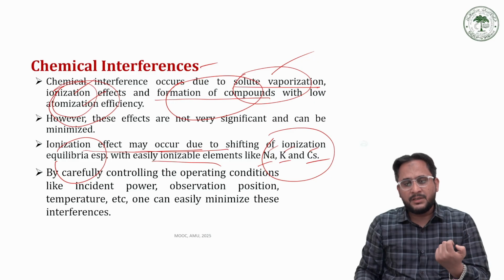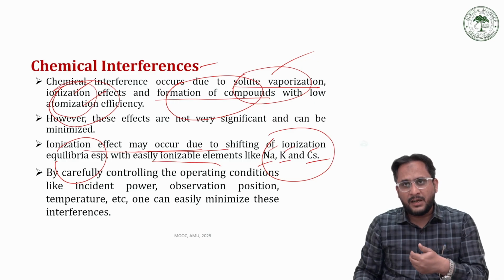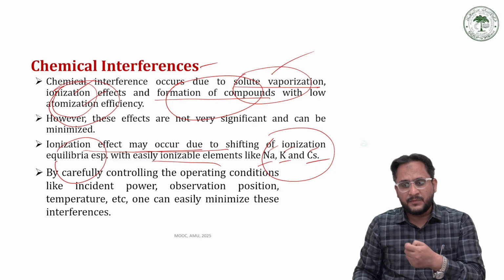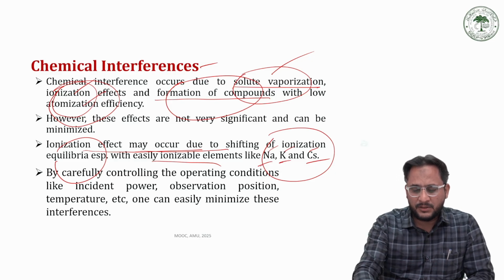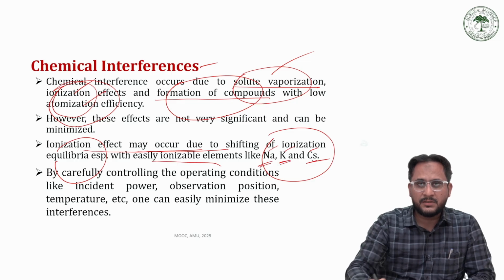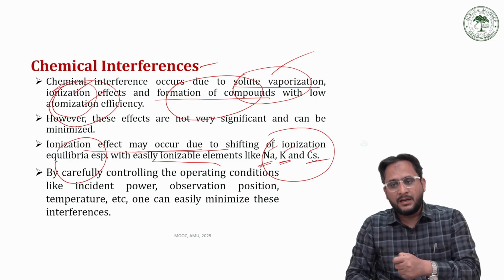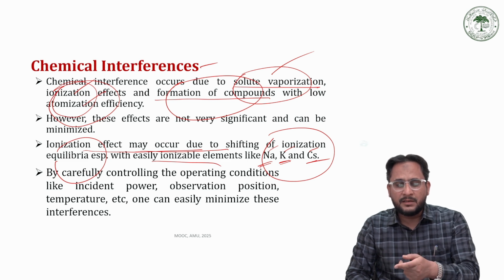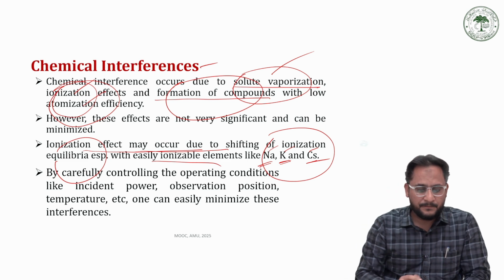Because of this, the ionization of high melting point elements is affected.